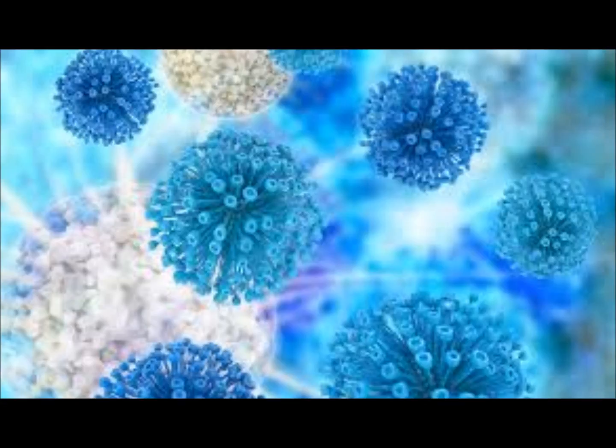Take it out as you use it, because how do you know what's on that table that you might introduce to the media? And we're just messing around for our practice, but if you're doing a real patient, don't you want to make sure that what grows is truly what's pathogenic from the specimen? So you as a tech always have to uphold aseptic technique.